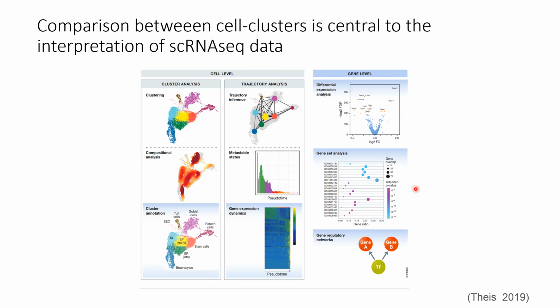So the set of genes expressed in each cell cluster are the input for gene set analysis as well, and also inference about gene regulatory networks. And cell clustering is a very important step in the analysis, but it's also mutable. So we've done a lot of work to acquire single-cell RNA-seq data, and the clustering analysis can always be revisited and recalculated as improvements in the analytical workflow continue to develop.